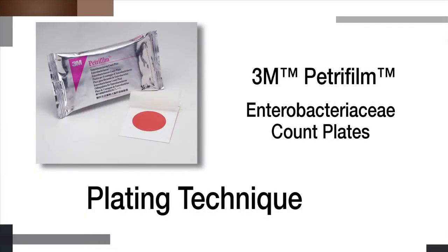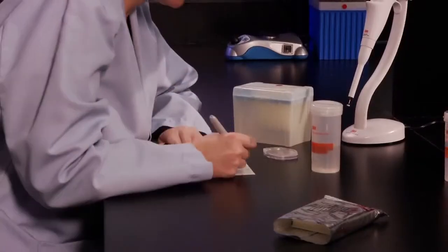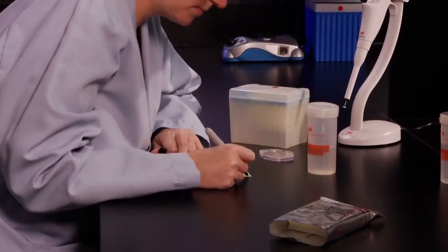Here is the plating procedure for 3M PetriFilm Enterobacteriaceae count plates that feature a foam dam to contain the inoculum. Label the plate and place it on a flat surface.